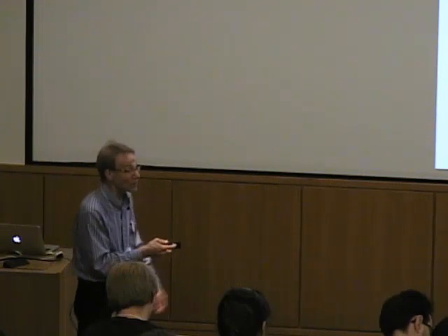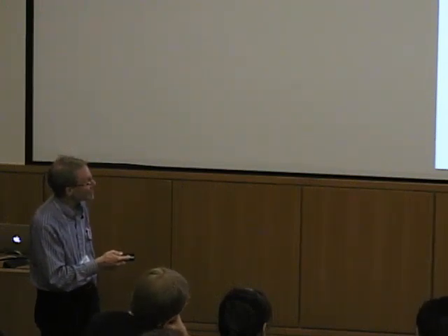So here's their model, okay? The peptide interacts with the lanthanide +3 ion. Deprotonation: they showed that the interaction leads to a lowering of the pH. Aggregation, and then finally precipitation. Notice a single arrow here, okay?